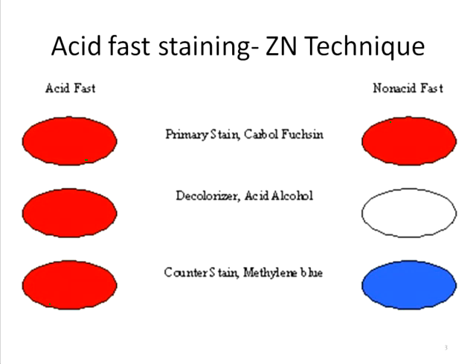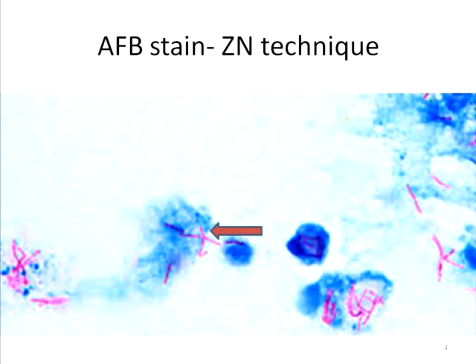Under the microscope at the 100x objective, this is how a sputum smear for acid-fast bacteria looks. You can see the background stained blue with the secondary dye, methylene blue, but the acid-fast bacteria retain the pink dye and appear pink in color. The arrow points to the acid-fast bacteria.